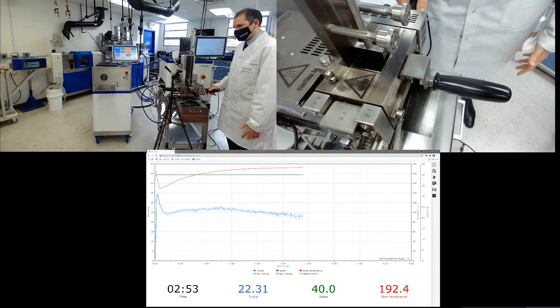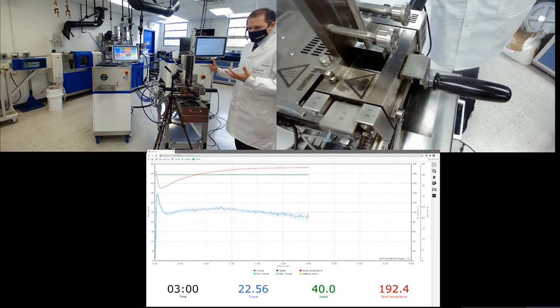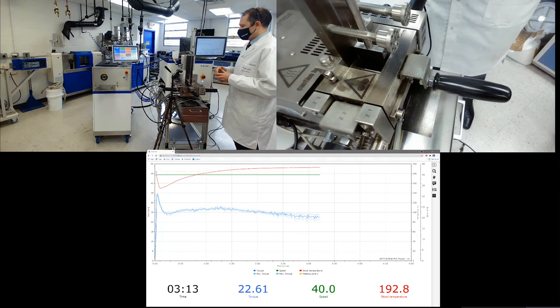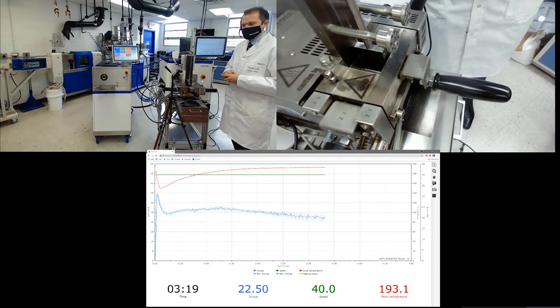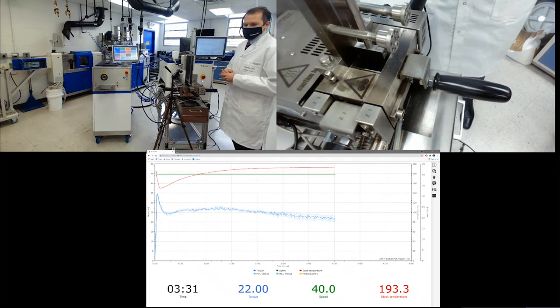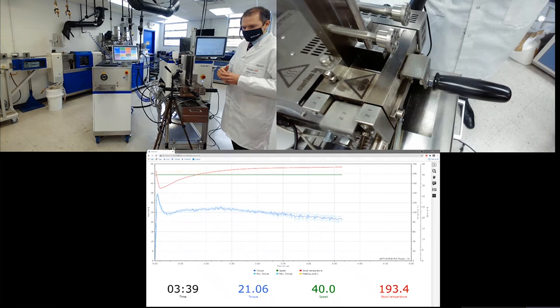We also have a multi-evaluation that of course allows you to select the points as vertical slices. For those who are new to torque rheometry, our motor is on a pendulum and has a lever arm that is connected to a capacitive load cell. This capacitive load cell measures a deflection in this lever arm based on the motor trying to spin against the momentum. It creates a change in capacity. This capacity is inversely proportional to the applied force and with that we have a super accurate measurement from 0.1 newton meter all the way to 200 newton meters in a linear perfection.